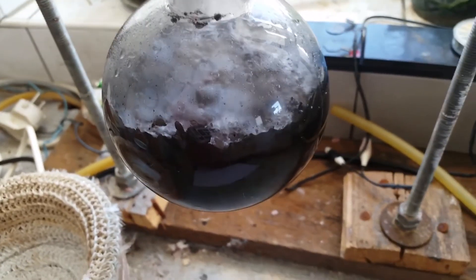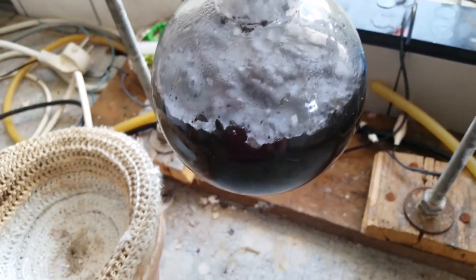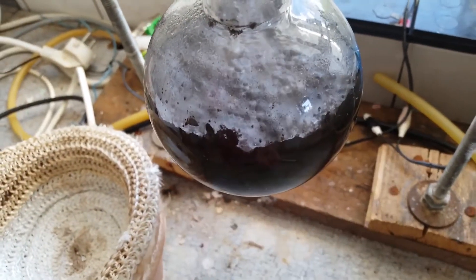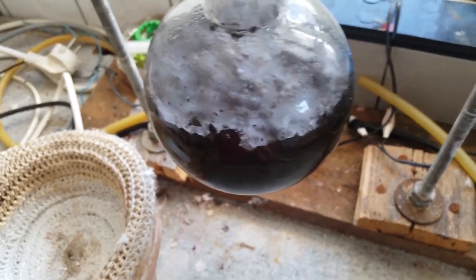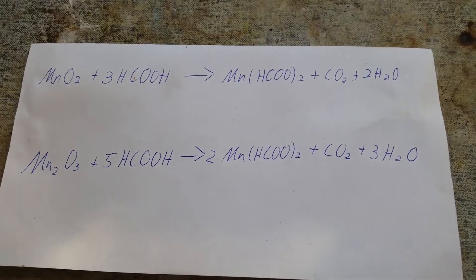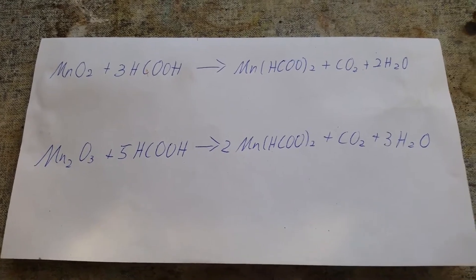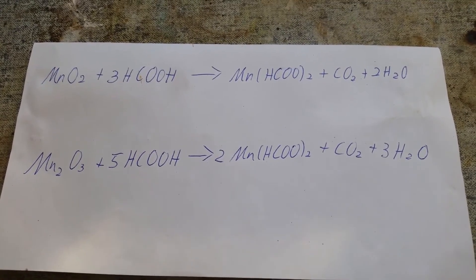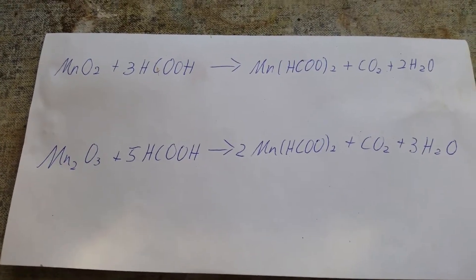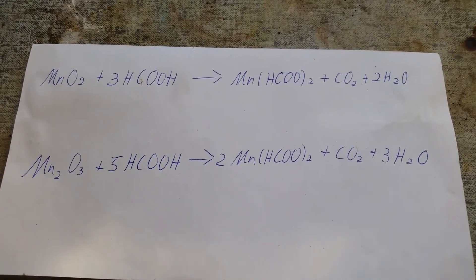I didn't expect it to react that quickly, but apparently it does. Also, this reaction already produces quite a bit of heat — it's like 50 degrees already. I hope it doesn't run away and go everywhere. Here you can see what's going on chemically: the formic acid gets oxidized to carbon dioxide and water, reducing the manganese to its 2-plus oxidation state. You end up with manganese formate, carbon dioxide, and water.